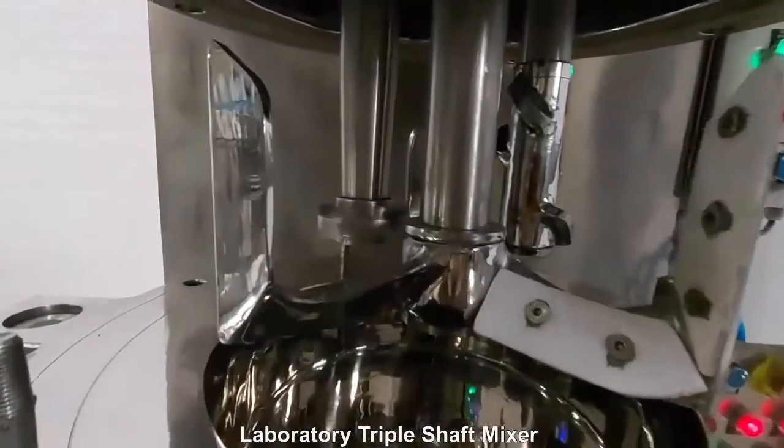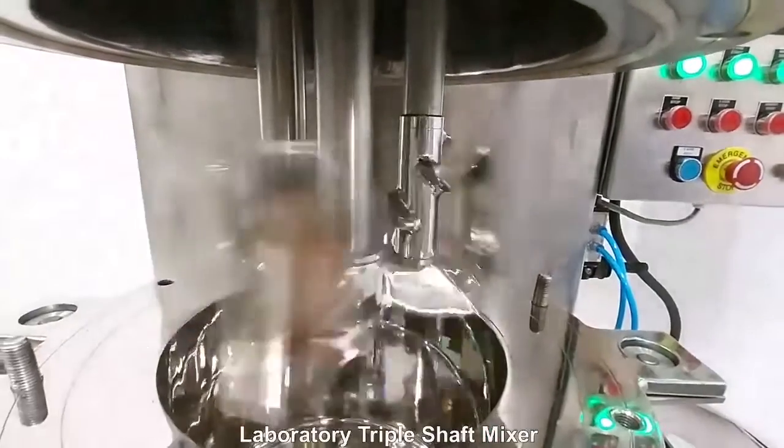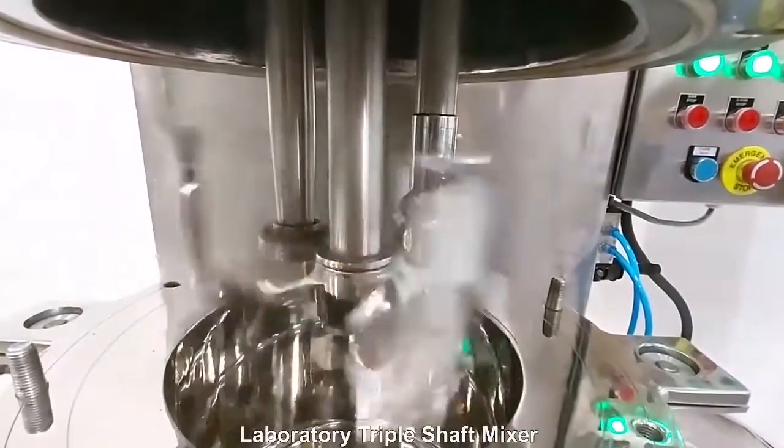This laboratory mixer has a capacity of 10 liters and is equipped with three mixing elements: the high-speed disperser, the three-blade anchor, and a paddle agitator.